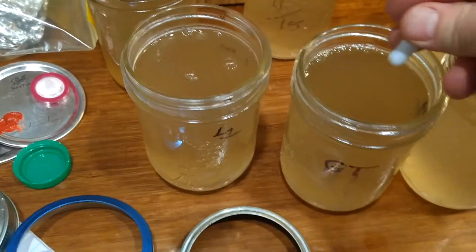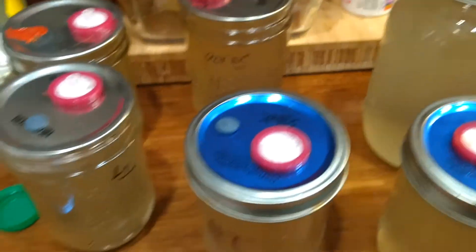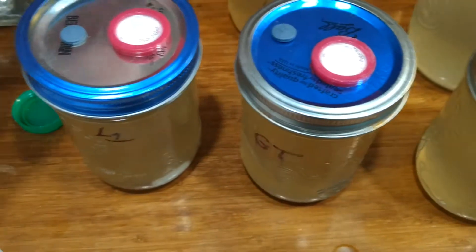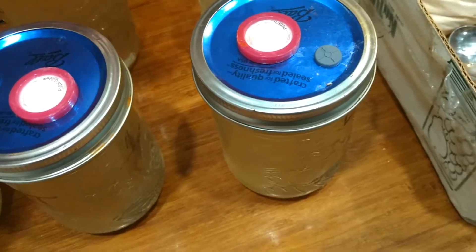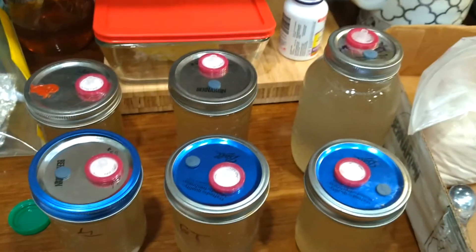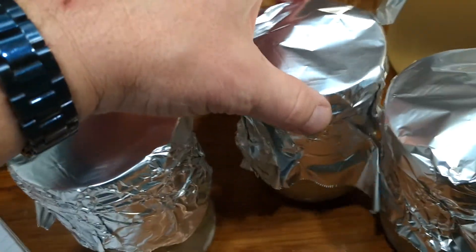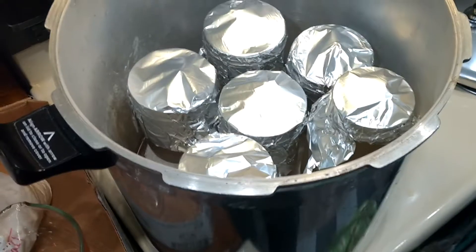You want to pressure sterilize everything. I have injection ports and the micron filter lids that I made — I will be making a video on that shortly. Put your lids on and then wrap your jars in tin foil. Make sure the lid is a little loose because you do not want to ruin the micron filters that are in there. Wrap them in tin foil and make sure the lids are a little bit loose.